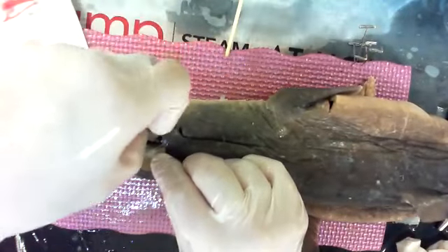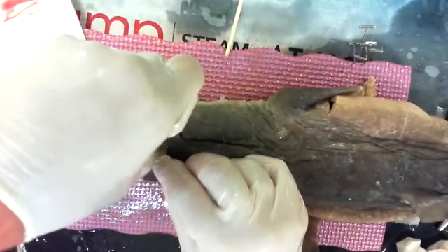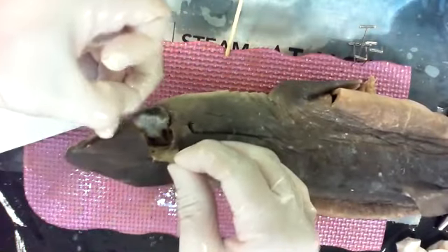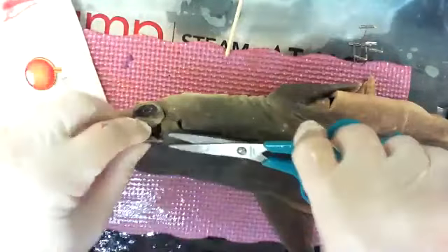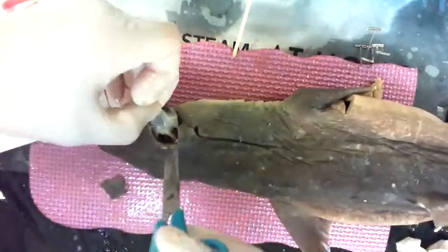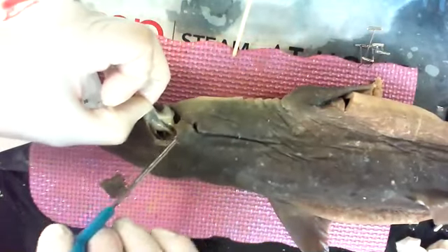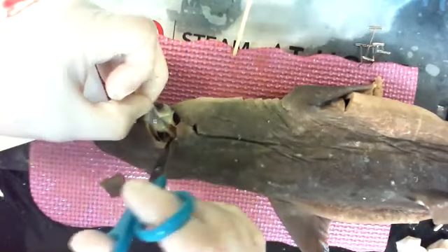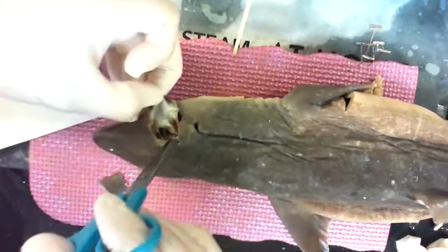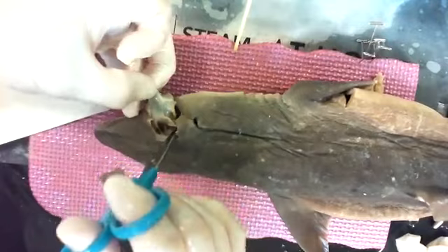I'm going to pull just a little bit, not too hard, and I'm not squeezing the eyeball either because it's like a grape. If you squeeze it, it'll pop. Wow, do you see those muscles in there? See them connecting? So I've stretched it out about as far as I'm going to go. First thing I'm going to do is cut this flap off. Yeah, it's removed. Now that I can see down in there, I'm going to cut each of those muscles as far as I can, so as proximal to the body as I can. There's another one, snip. There's another one, snip. There's another one, snip. Shooting for 6 snips.